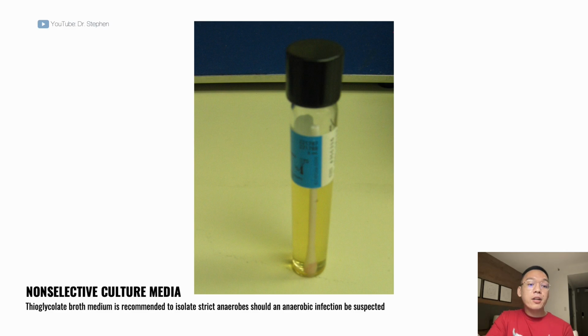Another non-selective culture media is the thioglycolate broth. This is recommended to isolate strict anaerobes should an anaerobic infection be suspected. Strict anaerobes don't need the presence of O2 in the atmosphere. That's why it's tightly sealed, and we're using this thioglycolate broth medium.